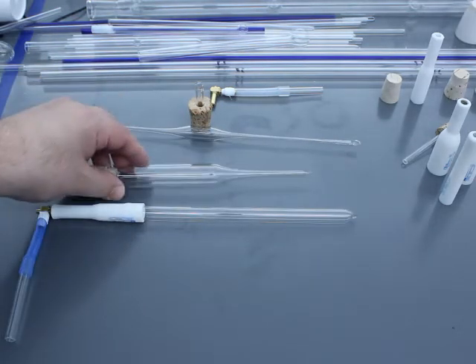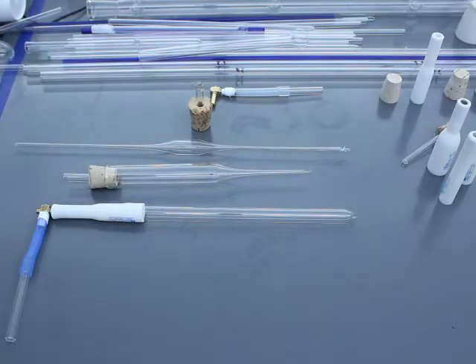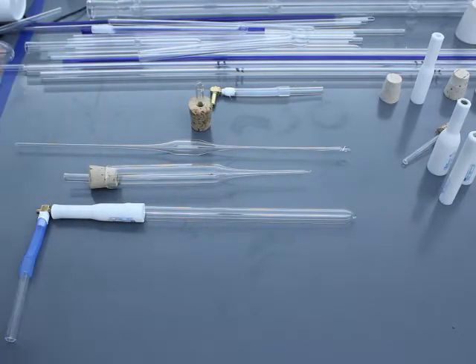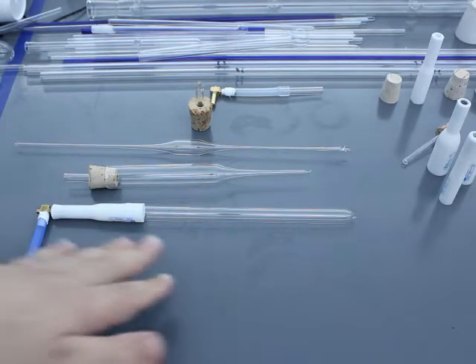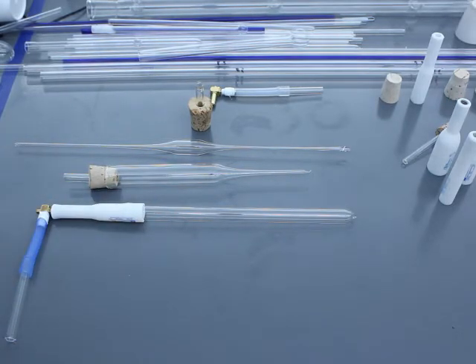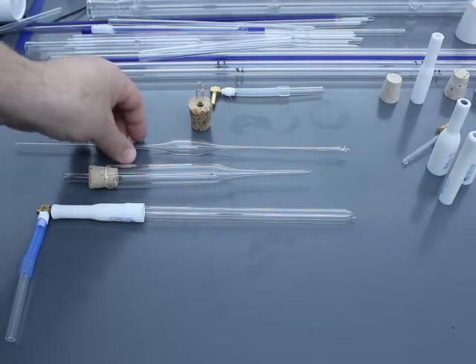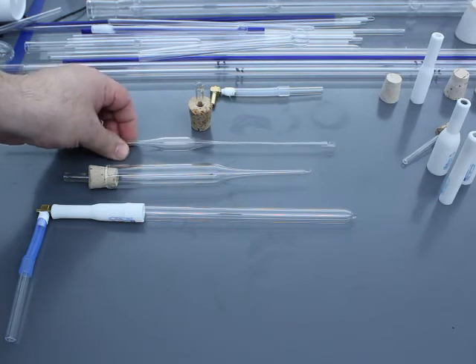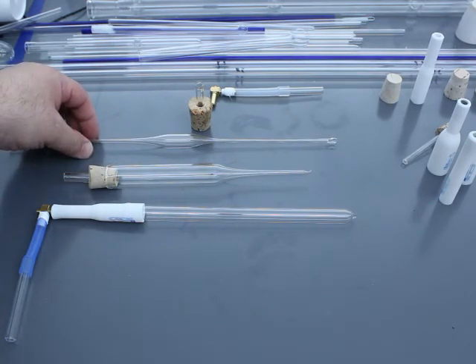So it's not a question of one method being correct versus the other. It's simply how you were taught. I was taught using the traditional blow hose with the corks. Many scientific glassblowers were taught pulling points. And you find that if you can do both, it really comes in very handy depending on what you're trying to accomplish. For me, the blow hose is really where I feel the most comfortable when I'm working with the molten glass, doing scientific glassblowing. But in some cases, if you're making like a little Christmas ornament or something like that with a point, that can actually be a little bit easier to do that rather than using the blow hose. But it really comes down to what your preference is.